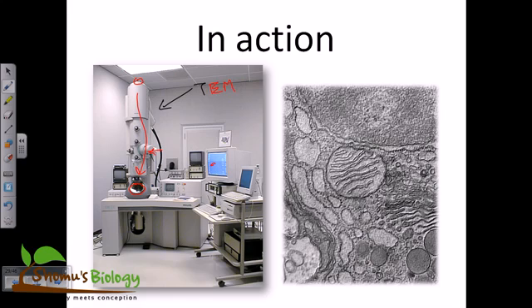As we are not using any light source, and electrons cannot give us the idea of light, because we are not using any wavelength of light, we cannot actually see colored images. We can only see the images in black and white like this. Okay, so you can see here the nucleus and all the structures, the endoplasmic reticulum sites are coming in or out. This is the Golgi apparatus, as you can see. These are the vacuoles that you can see inside the cell, right? So this is how the transmission electron microscope looks like.